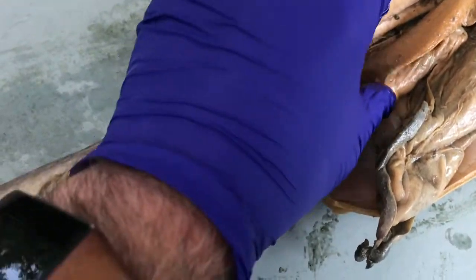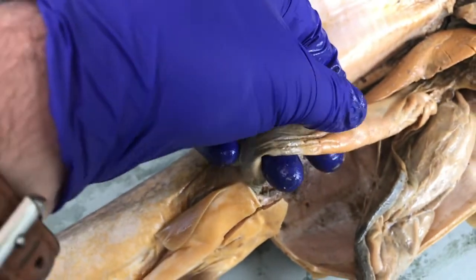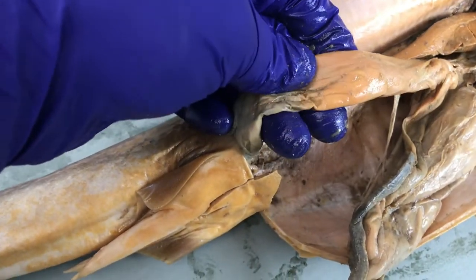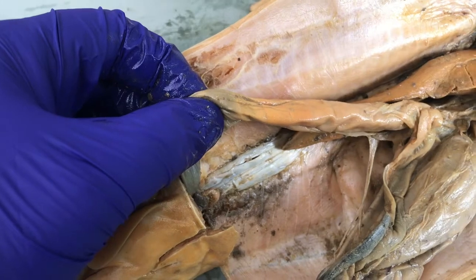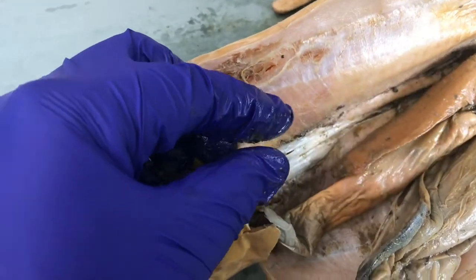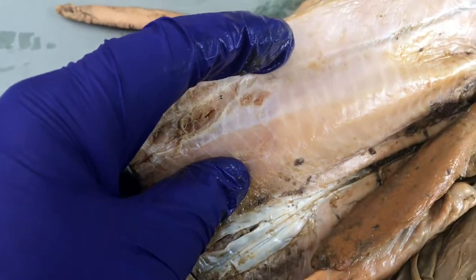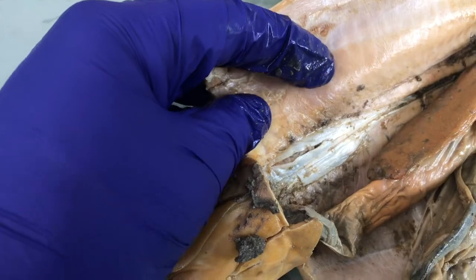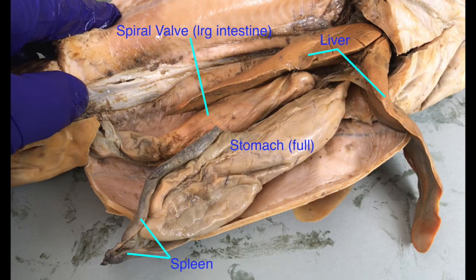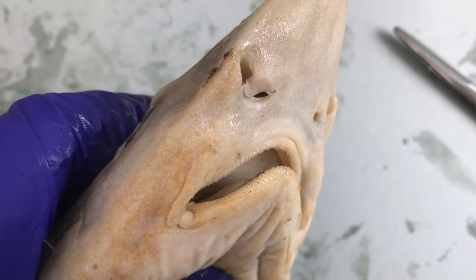There's some other kind of prominent things in here, and that's the large intestine, which also has some stuff inside, but it's probably well digested and quite goopy. And as I mentioned earlier, this is known as a spiral valve in the sharks, and you can see some little ridges in there that indicate that. Some other interesting features you can see here. You can see kind of the layers of muscles, these ridges. This is in the side or the body wall of the shark. Noting all the muscles there. Up there, and we're going to try to zoom in on those under the microscope here in a minute too.